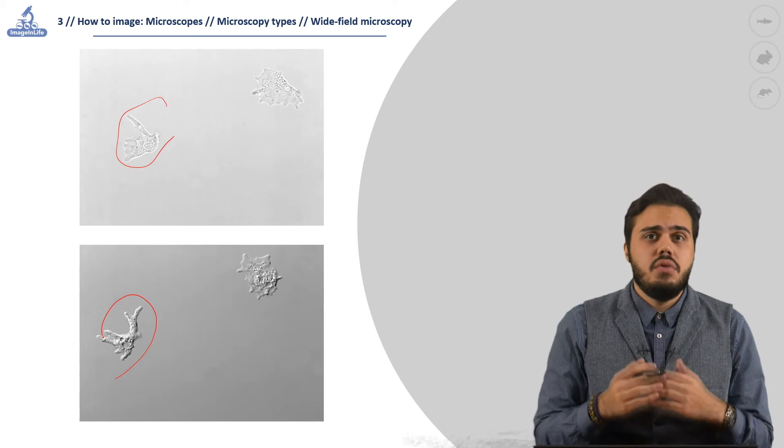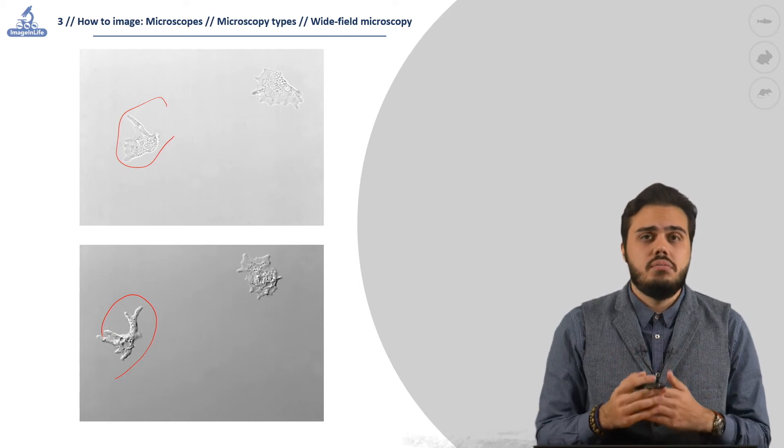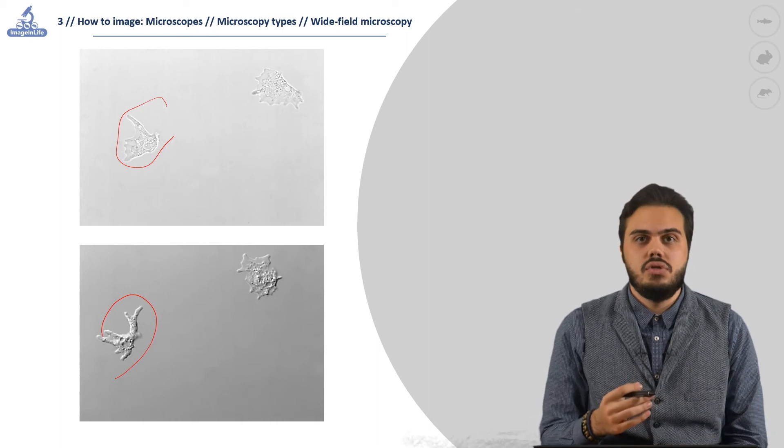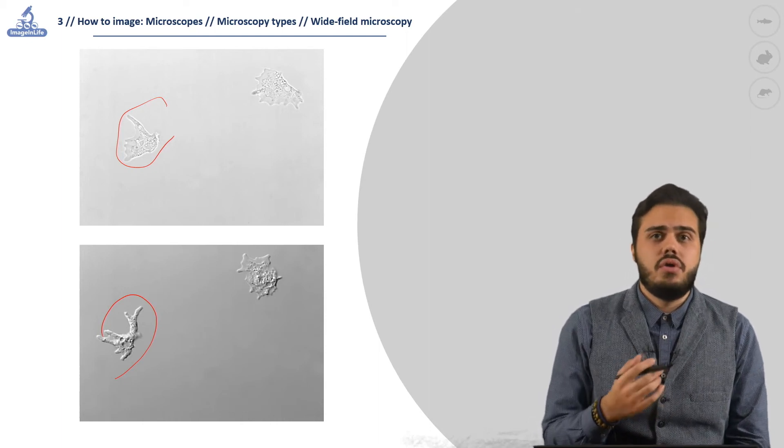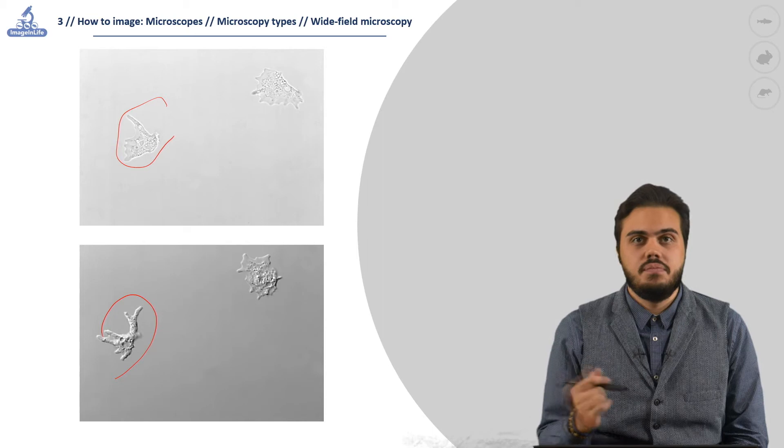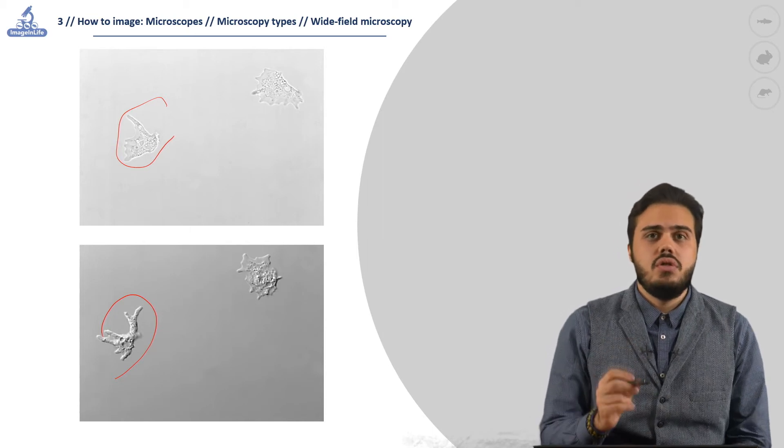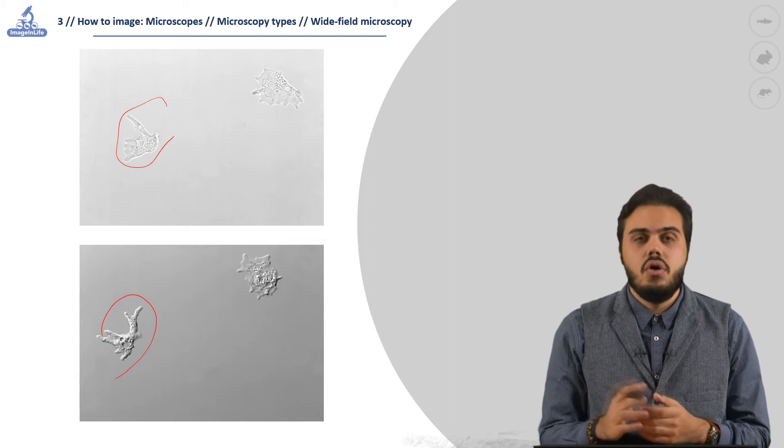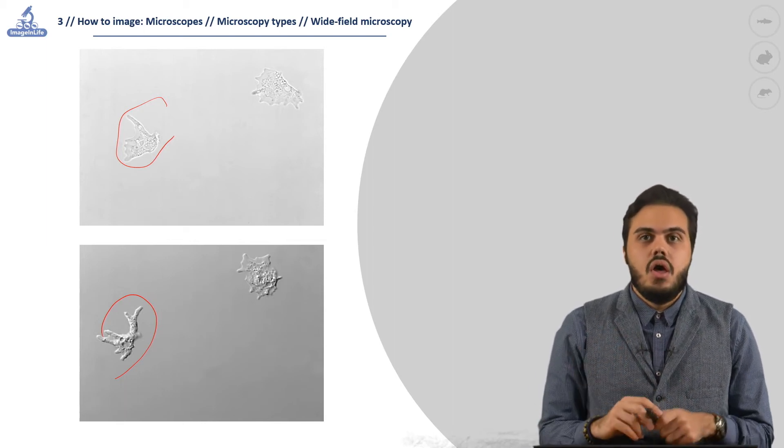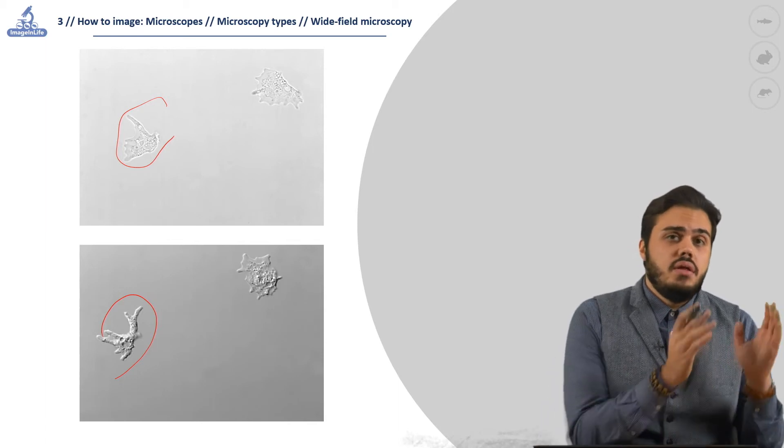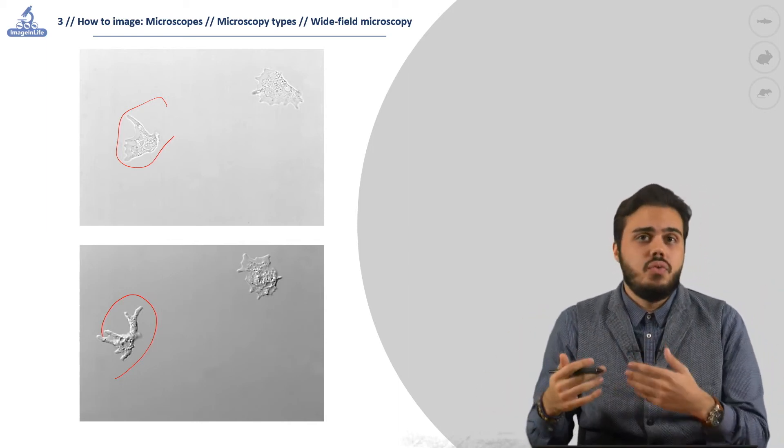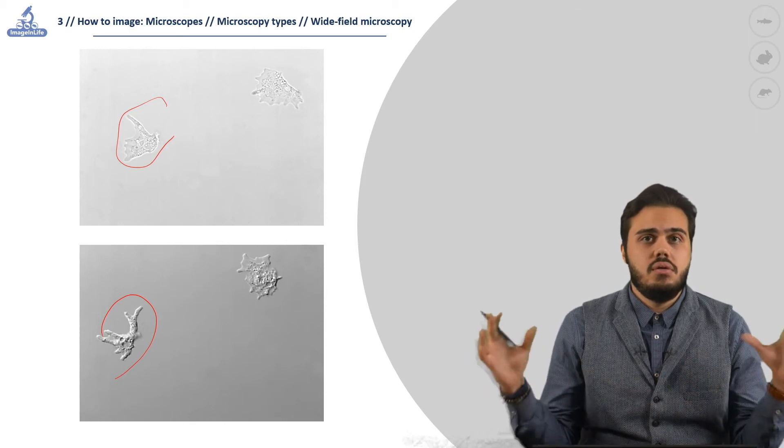Furthermore, this technique can be combined with fluorescent microscopy, obtaining images with higher contrast and resolution, but at the cost of reduced light intensity. To use this combination, it is necessary to use two cameras on the microscope or one camera with a really high frame rate. This can acquire separately the DIC image and the fluorescent image, and the software will combine them later into a single image.